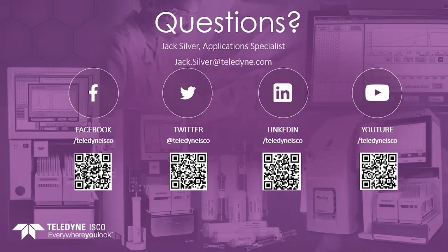Okay, we have another question. Can you speak to how to configure a new scouting method for the focus gradient generator for a new column? I am assuming that the new column is on the system, on the ACCQPrep. So what you would do is go into configuration, and then use the configuration screen and choose Prep HPLC. If the column is already installed, you can select that column and choose a new method and/or edit methods, and then there's a new scouting method button that you can choose.